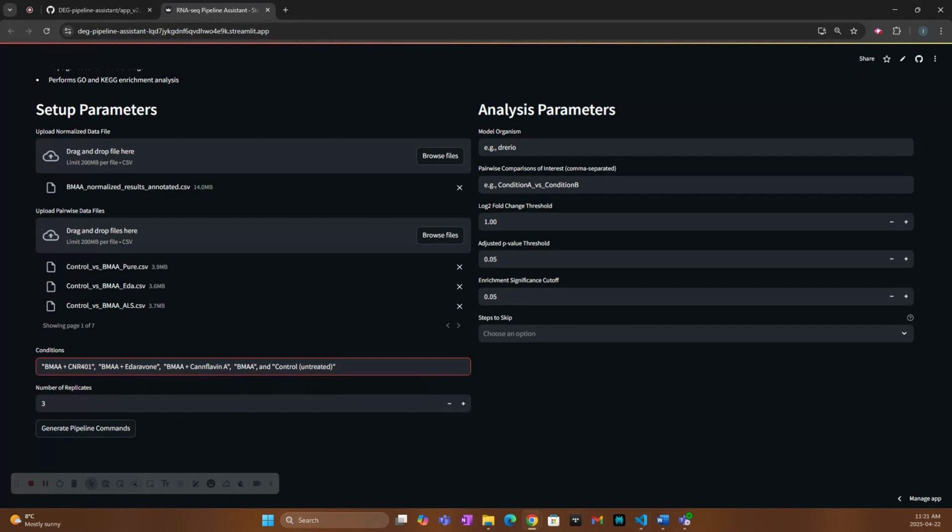And one thing that's really cool about this app is that the first layer where all these parameters get sent integrates ChatGPT through an API call. So you don't have to use exact syntax with quotes and commas. I can write something like "here they are" ahead of all these conditions, and I'll show you that that'll be transformed properly to create the command.